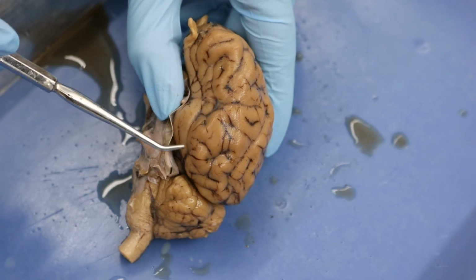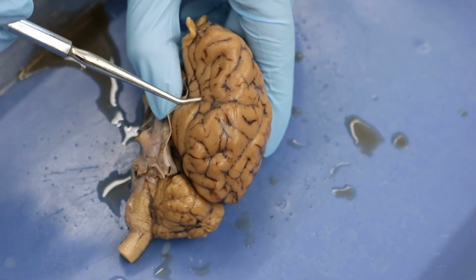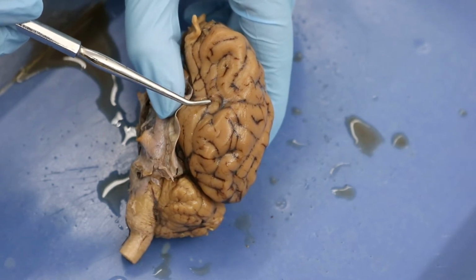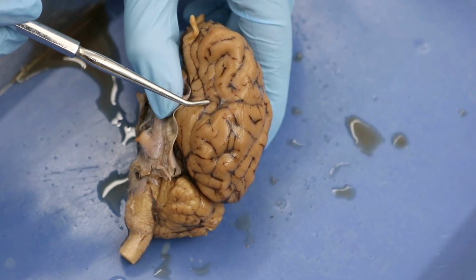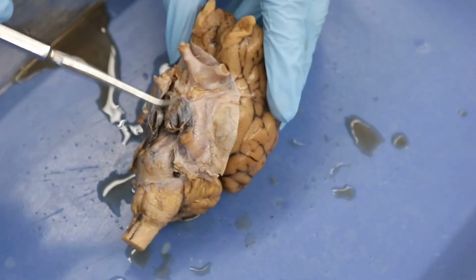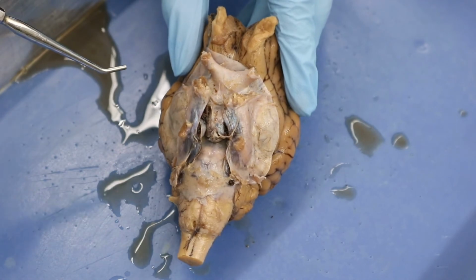And then we have our rhinal sulcus that is going just above the piriform lobe, okay? I think until we do a dissection, that's the best we can see right now because we just have too much of the meninges in the way. So we'll see in a sec.